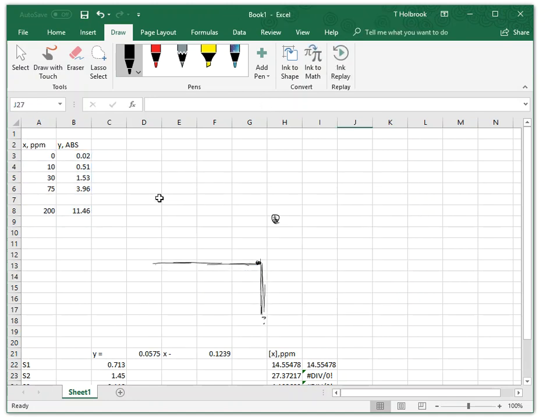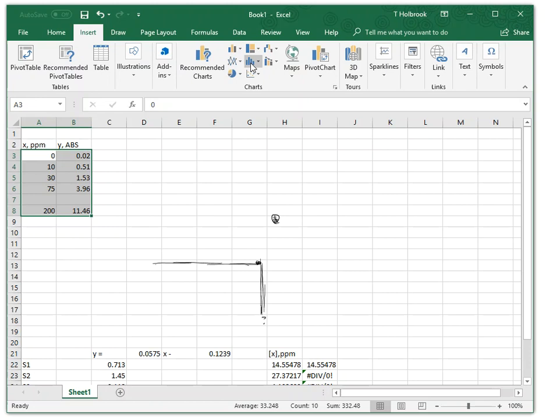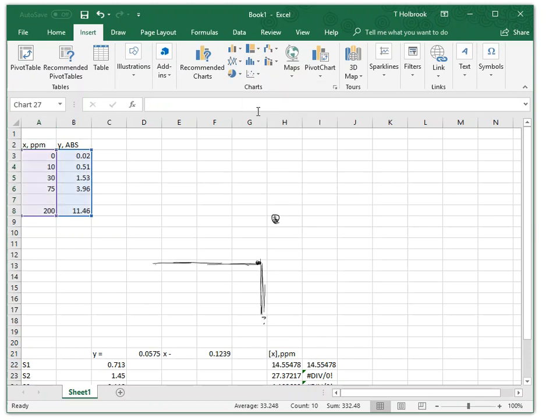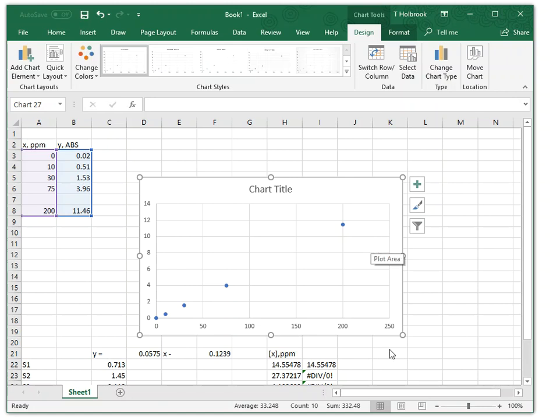All right. So I'm going to highlight the data again, and I'm going to insert, go to scatter plot, and plot the points, and that's it. That's all that I want to do. I can visually look at this and see that it's linear, right? So I probably have an idea that it's going to be a linear regression curve.